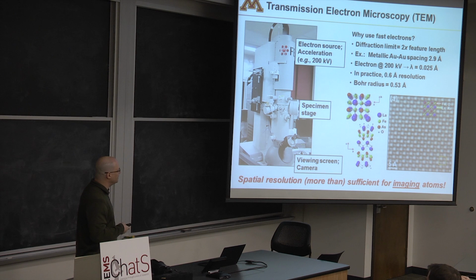Well, that's great, but I'm much more interested in understanding how these things move around at this scale. Nothing is static. Everything is moving. All the atoms in this room and you and everything are vibrating and moving. Nothing is stationary. What's more, when materials go through a phase transition, if you talk about forming martensite, for example, those atoms have to move and rearrange themselves somehow to form this new structure. So the question is, how do they do that? And can I watch it happen? That's what we're very interested in trying to understand. So before we do that, let's figure out what this can do in that sense.